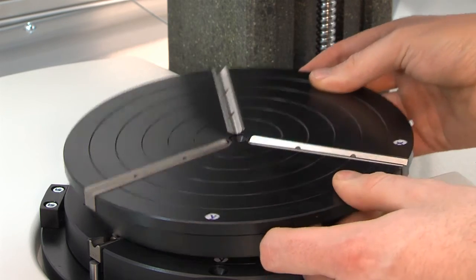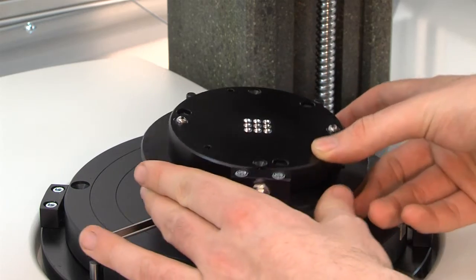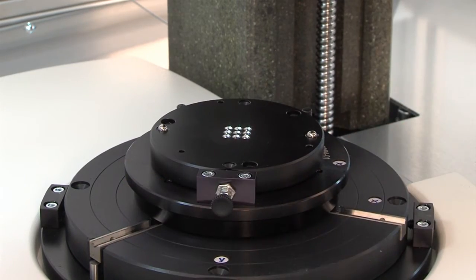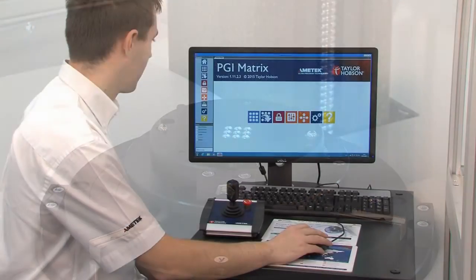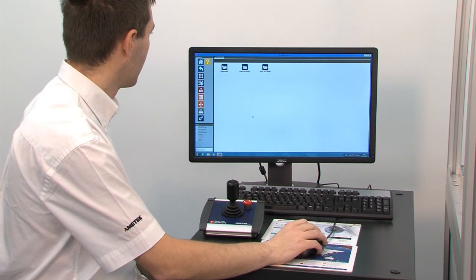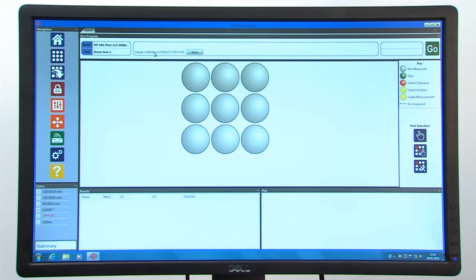Part set-up is quick and easy. To start the batch measurement, select the batch template and hit go.